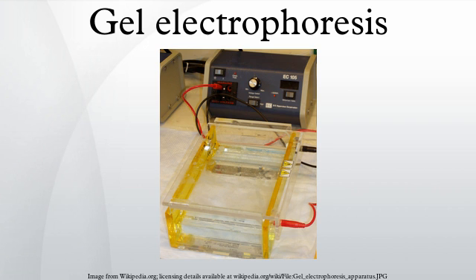Gel conditions, denaturing. Denaturing gels are run under conditions that disrupt the natural structure of the analyte, causing it to unfold into a linear chain. Thus, the mobility of each macromolecule depends only on its linear length and its mass-to-charge ratio. Thus, the secondary, tertiary, and quaternary levels of biomolecular structure are disrupted, leaving only the primary structure to be analyzed. Nucleic acids are often denatured by including urea in the buffer, while proteins are denatured using sodium dodecyl sulfate, usually as part of the SDS-PAGE process.